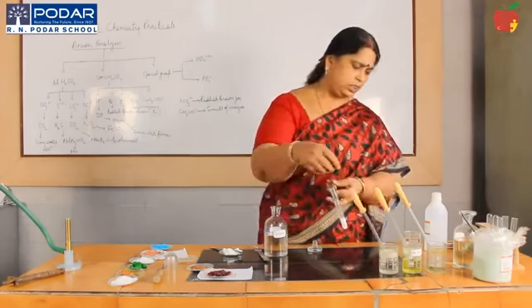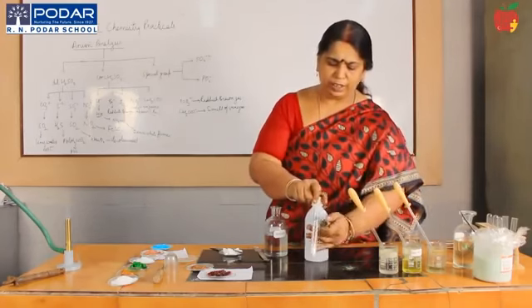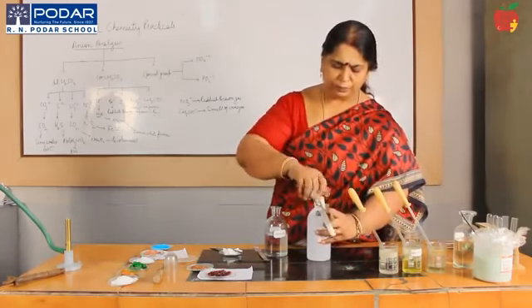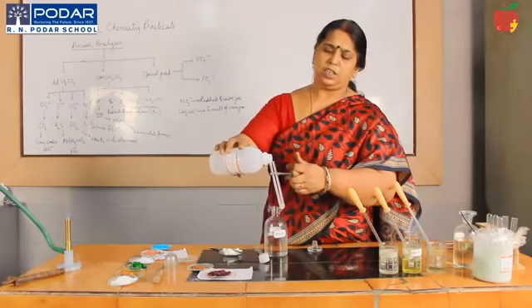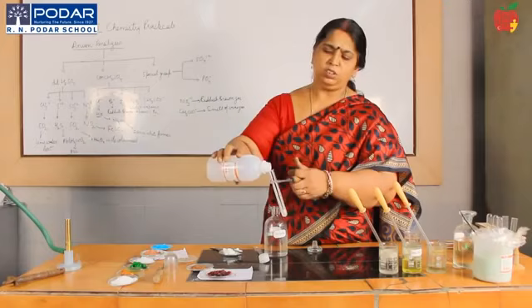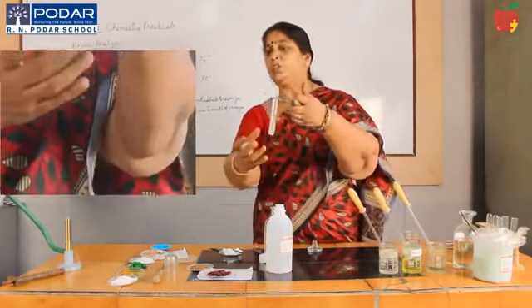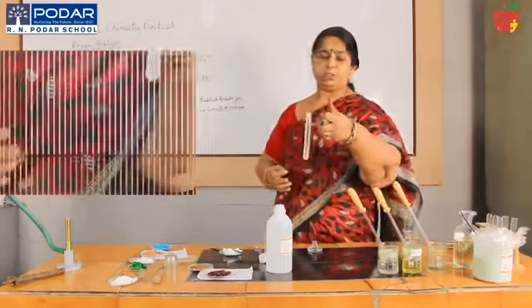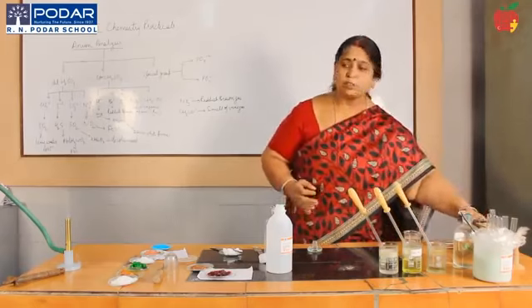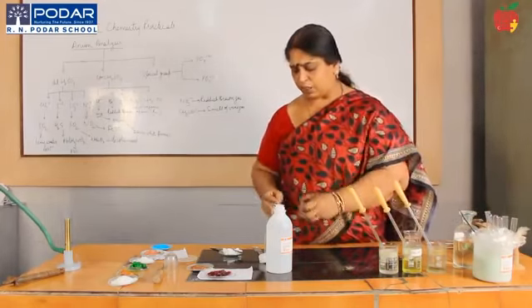This carbon dioxide, when you add lime water to it, should turn milky white, right? It should turn milky white. Just add lime water. I am adding lime water. It should turn milky white because of the formation of calcium carbonate. Okay, so again you should see that. So the brisk effervescence that was evolved is carbon dioxide.